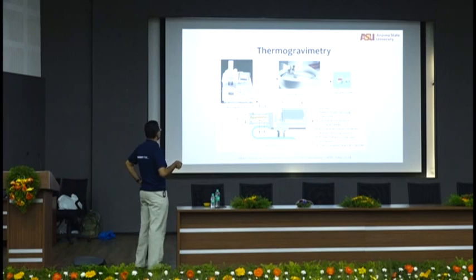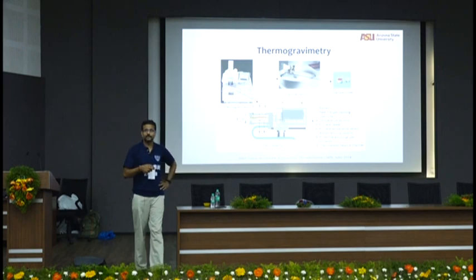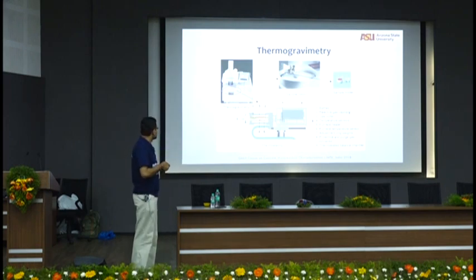Basically, you have a sample chamber that you keep it in. You can have a sample robot, but typically graduate students are the robots. They can do the work. But if there are so many samples, there are systems where you can place 50, 60 samples at the same time in small sample holders like this.